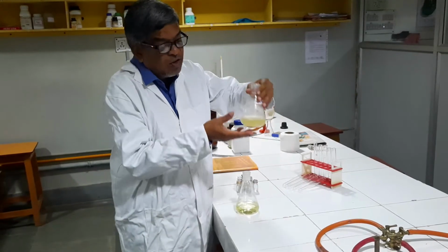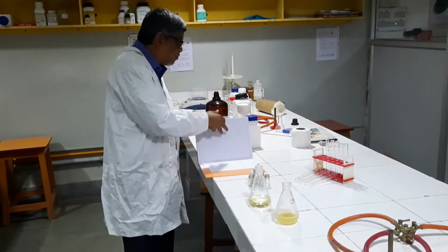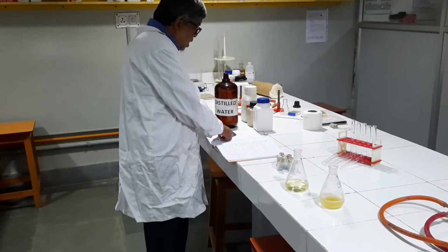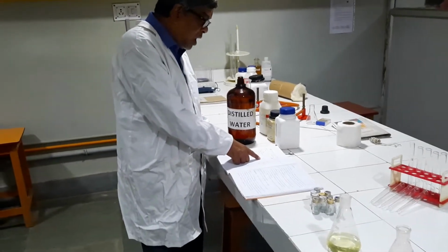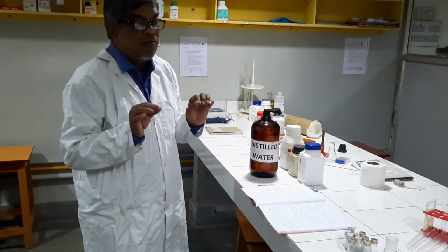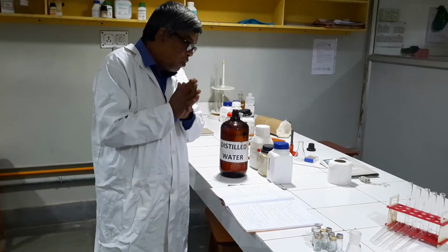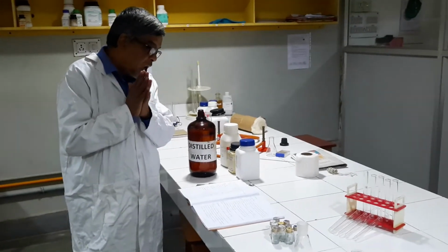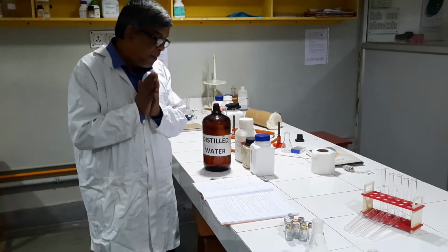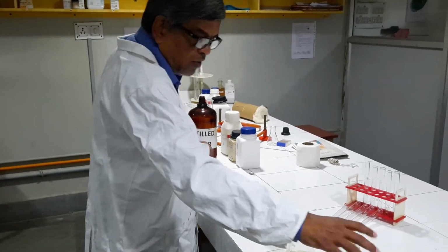This is a solid balanced food for microorganisms. Peptone is giving the source of protein, beef extract is giving the source of lipid, sodium chloride is maintaining tonicity and giving an ionic source, and agar gives nothing else, it only solidifies. I repeat, peptone source of protein, sodium chloride source of ionic and isotonicity, beef extract gives the power of lipid, and agar-agar in the second one gives the power of solidification.